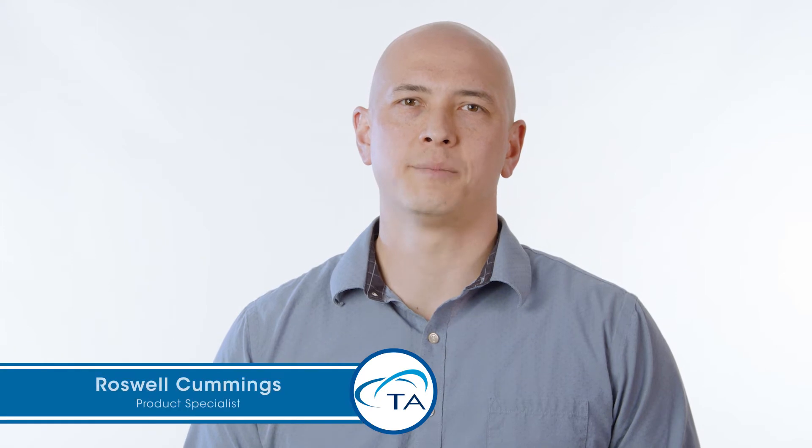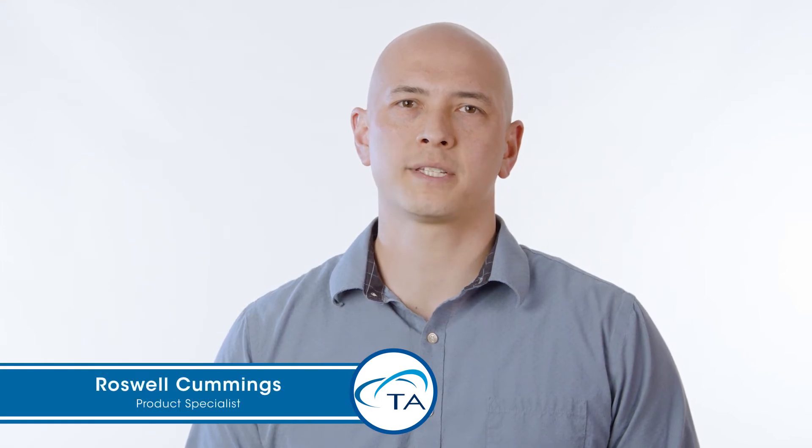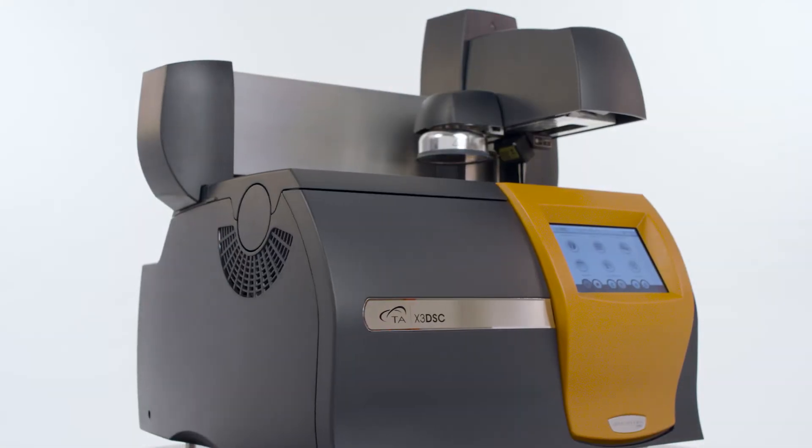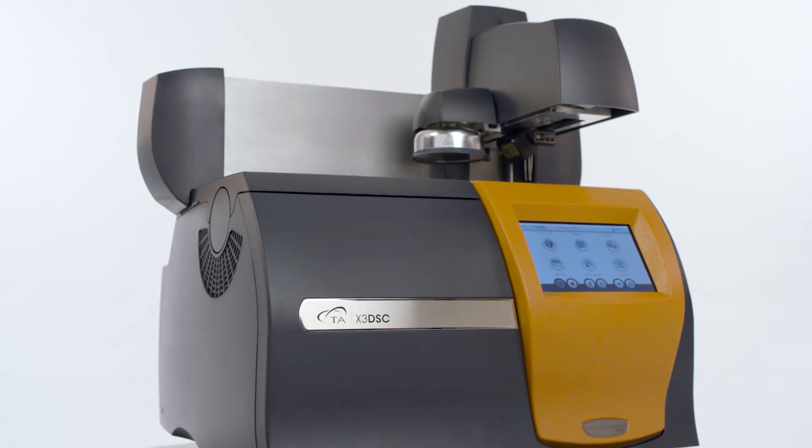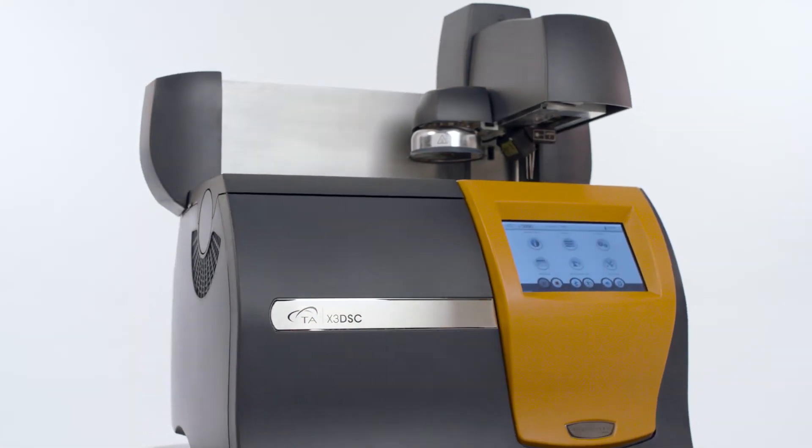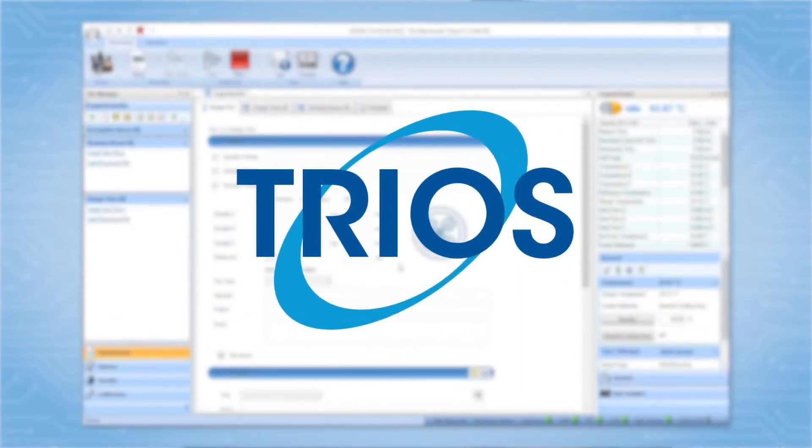Hello and welcome to another TA Tech Tip. In this Tech Tip, we'll show you how to set up experiments on your X3 DSC. Programming experiments on the X3 DSC is a straightforward process using the TRIOS software package.